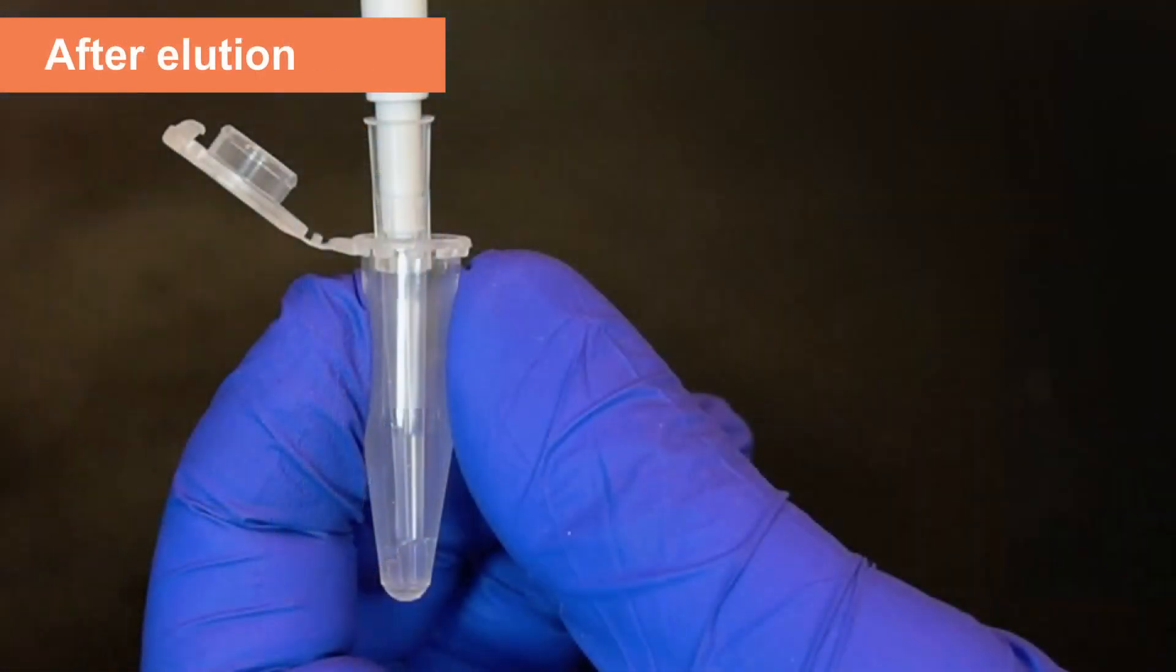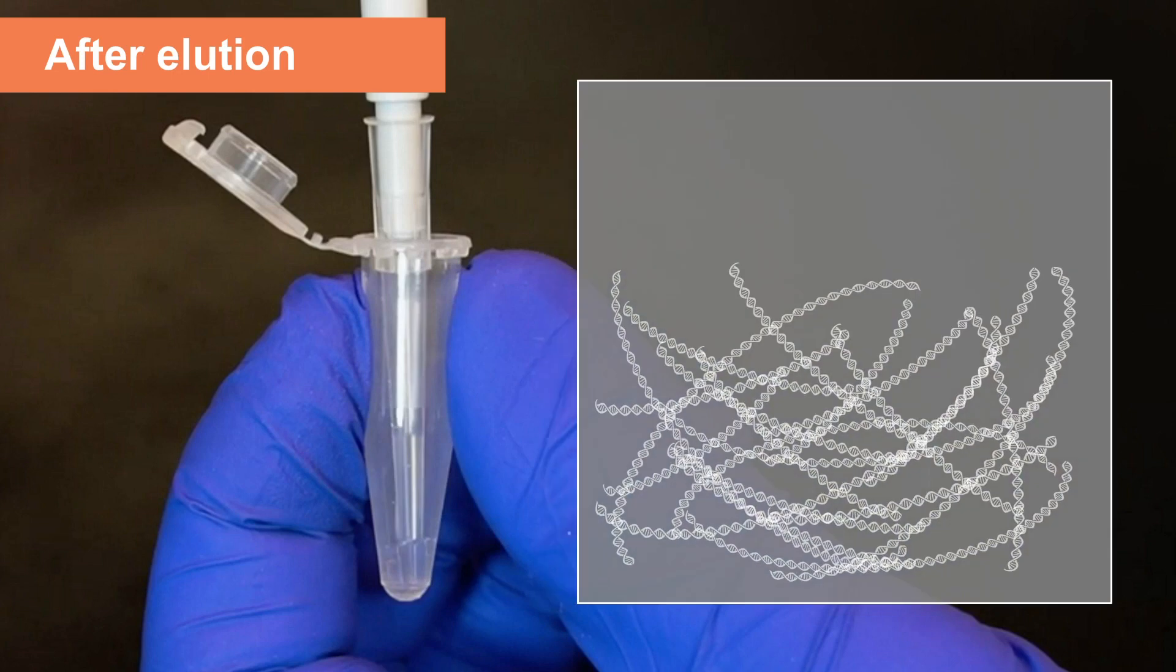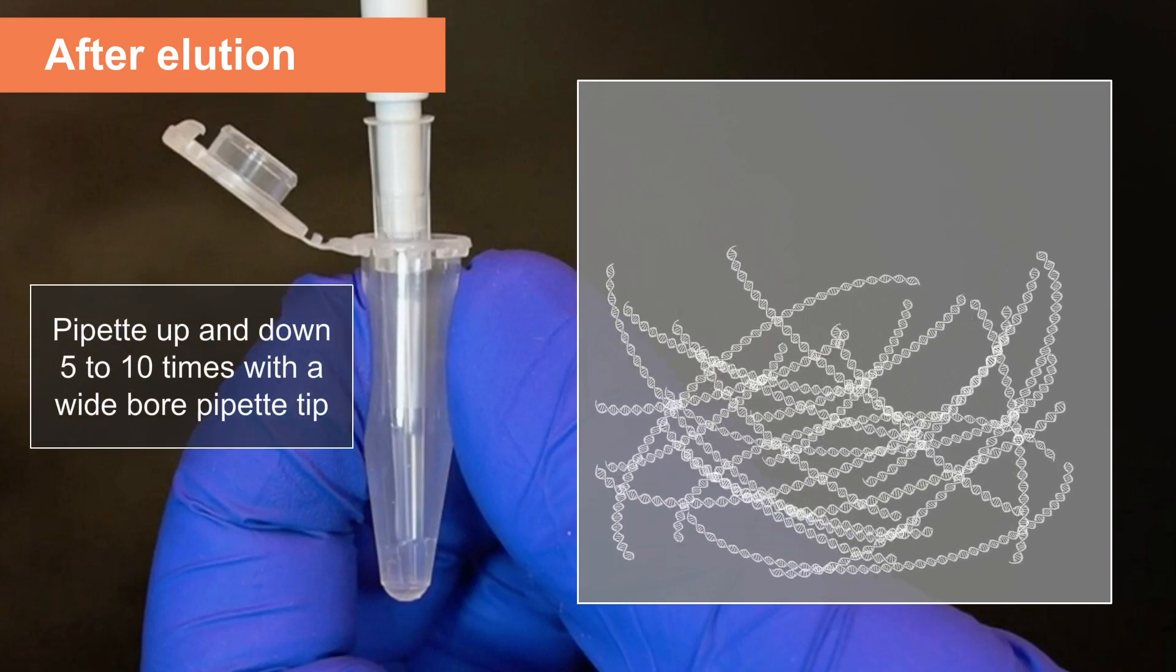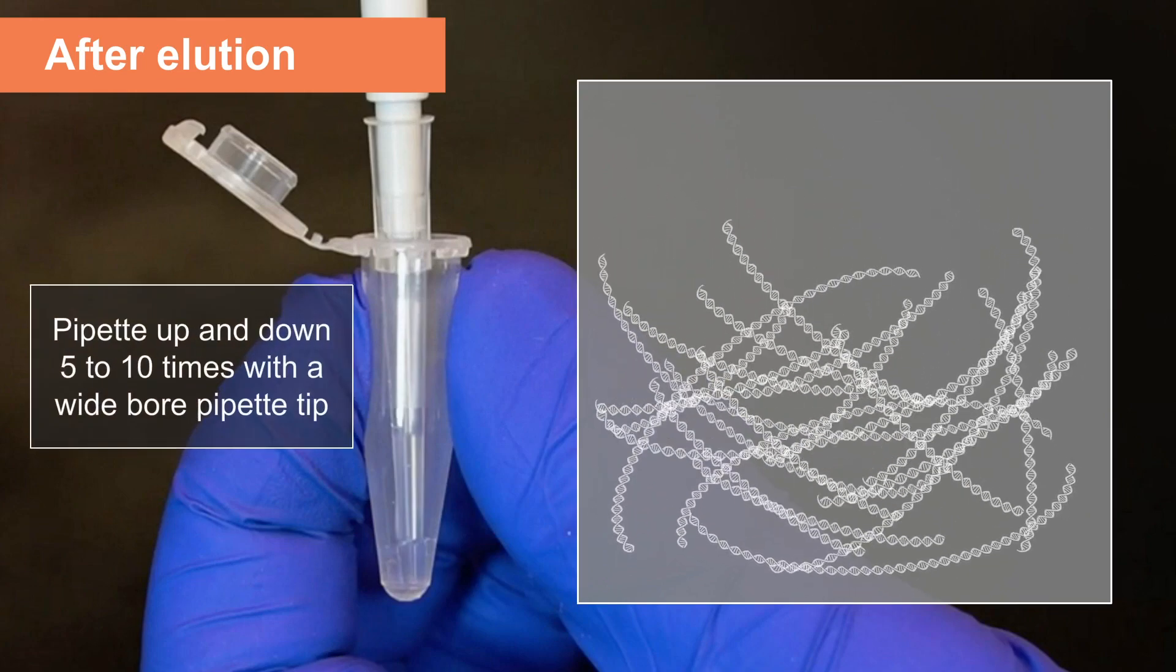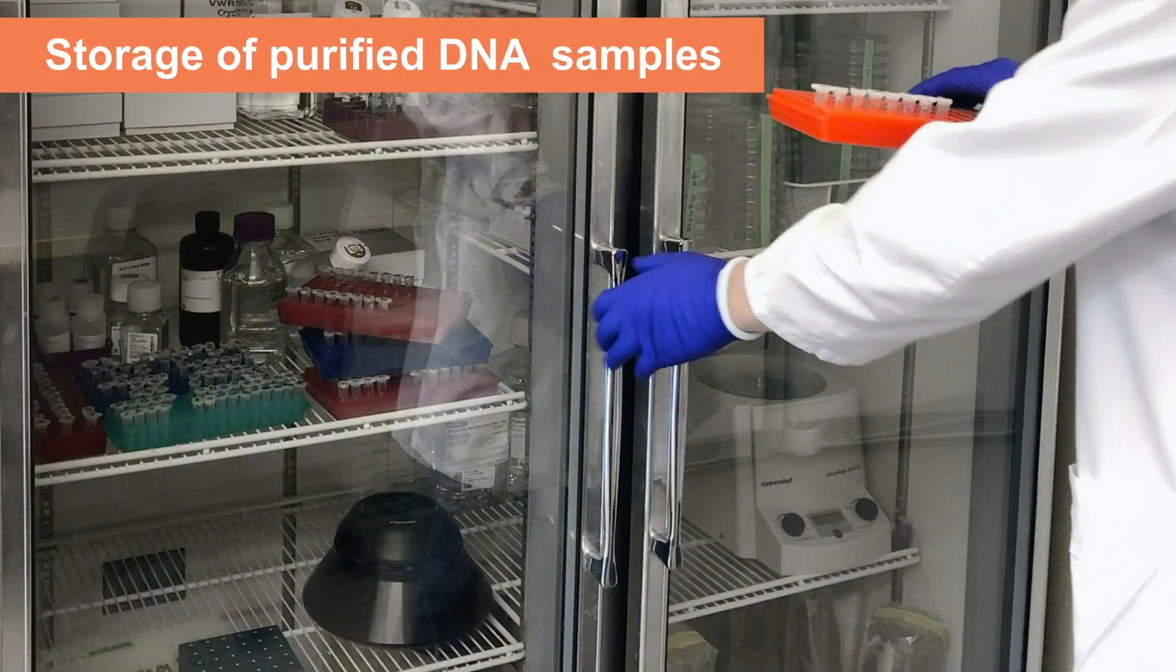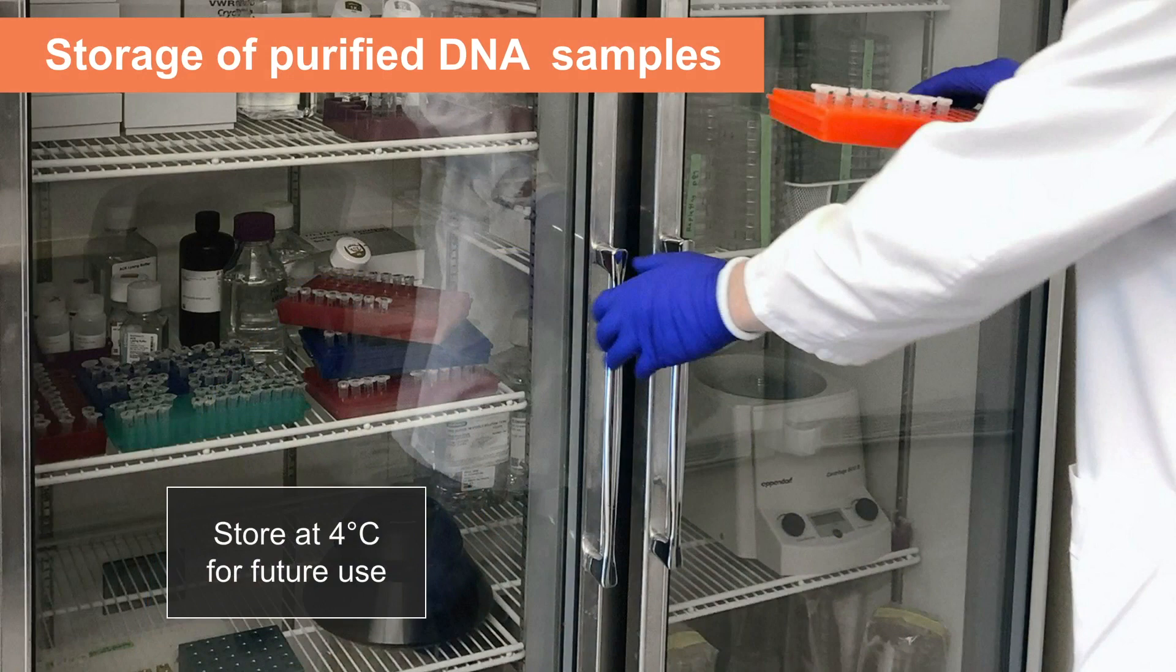After elution, high molecular weight genomic DNA requires further manipulation before use and measurement. The eluted DNA will not be uniformly dispersed and often clumps in certain parts of the solution. Pipetting up and down 5 to 10 times with a wide-bore pipette tip can help ensure that any visible clumps of DNA are dispersed into the solution. Purified DNA samples can then be stored at 4 degrees Celsius for future use or can be prepared for downstream use as described in the product manual.